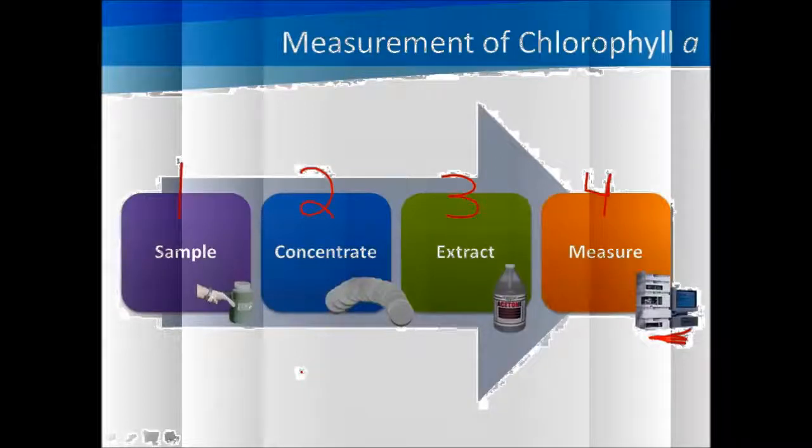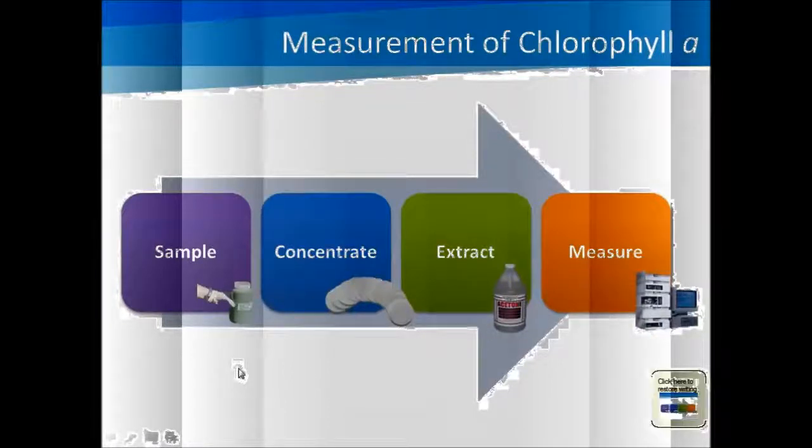So some obvious limitations of this approach are the labor, the time, the cost of collecting and analyzing all these samples. It can also be really difficult to capture a bunch of high-resolution data, which means you could miss natural dynamics and short-term events that can occur really rapidly. But the big advantage of that measurement is you get very accurate quantitative readings.